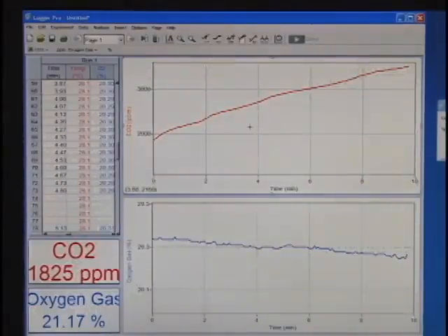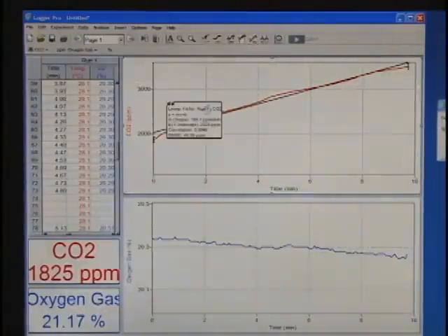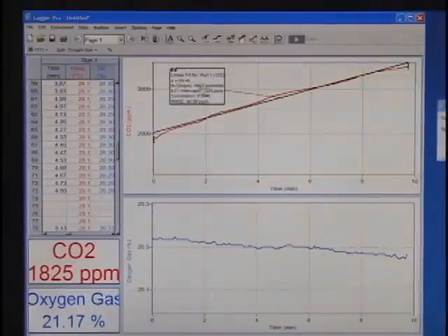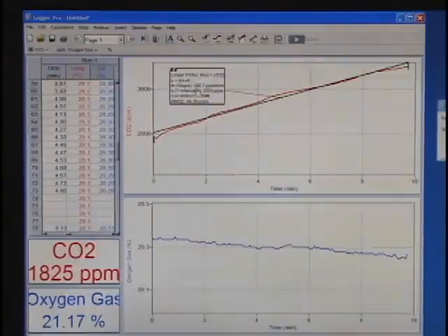Click on Linear Fit on the toolbar and record the slope in your data table. This is the rate of CO2 production for the germinating peas.